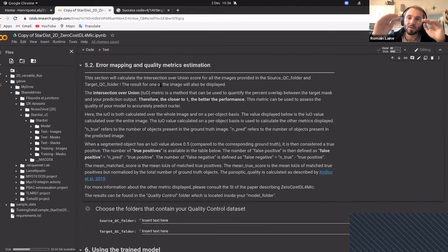But every time you come back to the initial step of training and reset a few more parameters and maybe retrain the model, you will slowly learn the features that are in your validation data set as well. So in one training session, of course, your validation will never be seen.